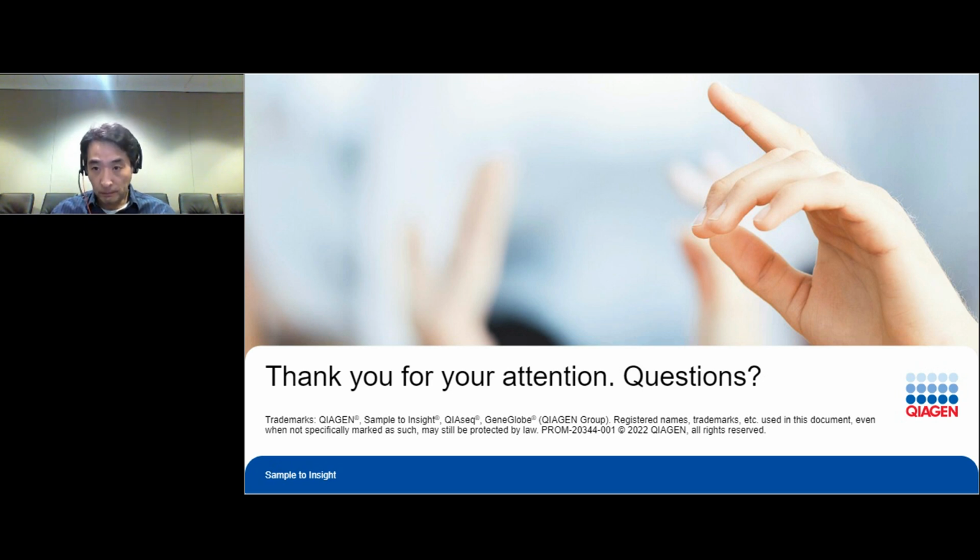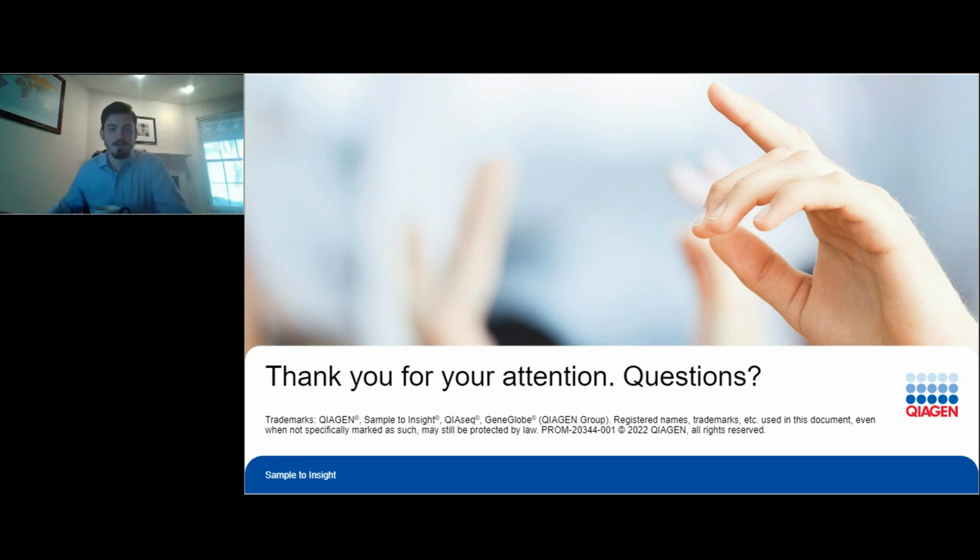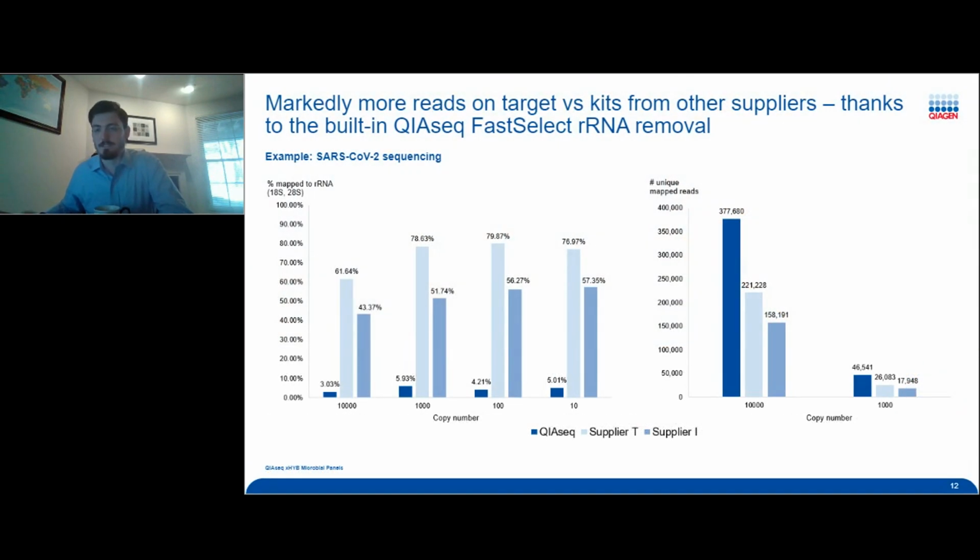Okay. Another question. Have you done any comparison on the performance of your XHYB panels and other pathogen-specific probe enrichment methods? Yeah, I can answer that. So that is actually what we are highlighting in these slides. So let me push this to you. So this is the respiratory panel specifically, and these were SARS positive samples.